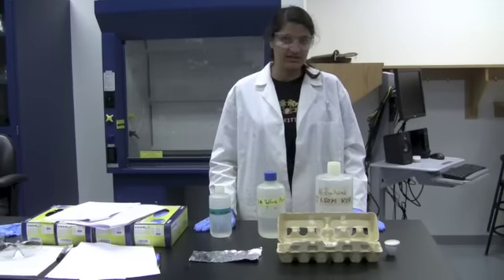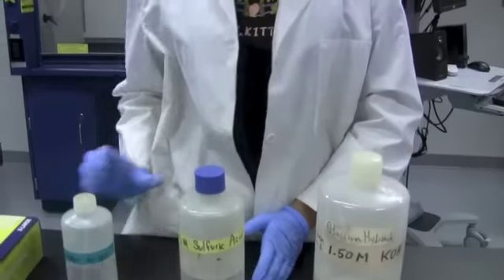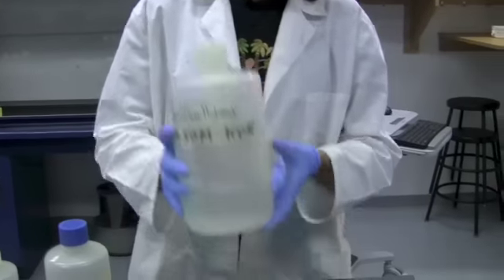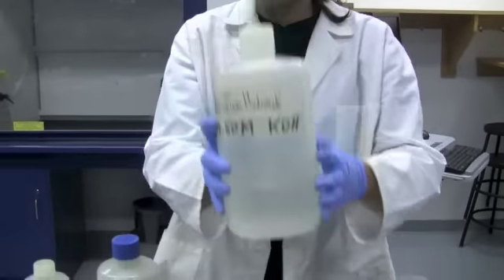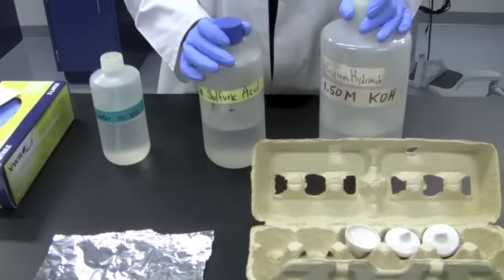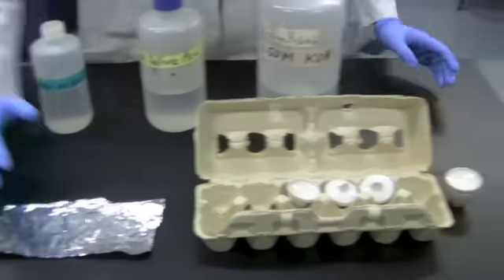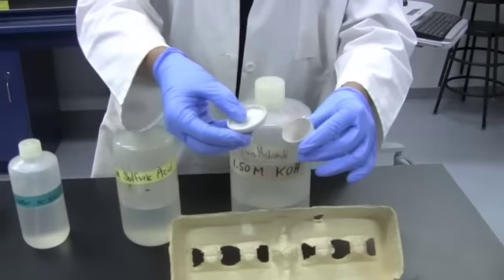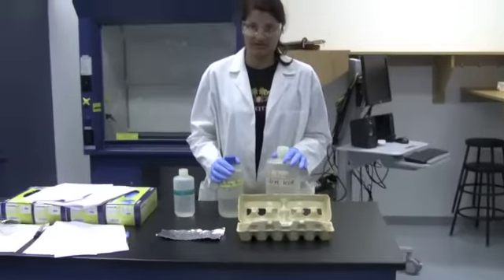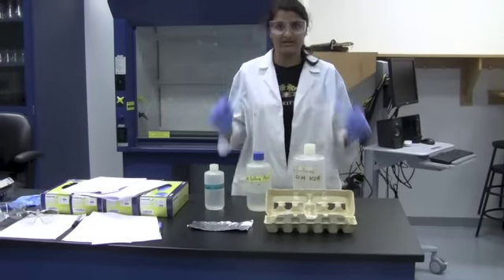You also need to remember to wear your safety goggles and closed-toed shoes. In week 1, the materials that you're going to be using are a 50-50 water and alcohol solution. You're also going to be using 3 molar sulfuric acid, 1.5 molar potassium hydroxide. And just remember that all of these need to be recorded in your lab notebooks because these molarities are going to be very important for your data and your calculations. You're going to also be using aluminum foil, and at the end of the day you're going to be weighing out this crucible. Now remember, because you're handling 3 molar sulfuric acid and 1.5 molar potassium hydroxide, that you should be wearing rubber gloves and also wear your lab goggles and closed-toed shoes.